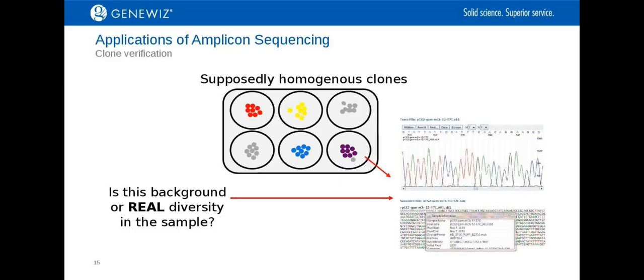So this provides an illustration of where Sanger sequencing may fall short if researchers want to find minor allele frequencies that are very, very small. Consider a sample that was thought to be truly homogeneous. If the majority of the cells had the mutation, the Sanger trace will look like the one on the right. However, you see this clone has a small percentage of cells that do not have the desired mutation. So you have to ask the question, is this background in your trace real or is it a false positive? With Sanger sequencing, you typically can't tell.